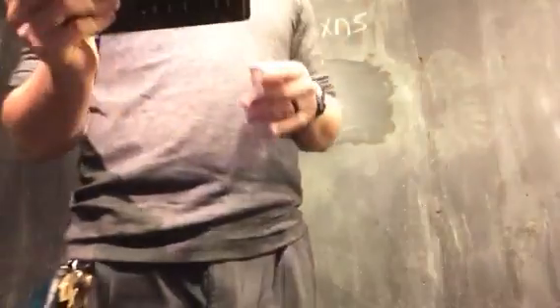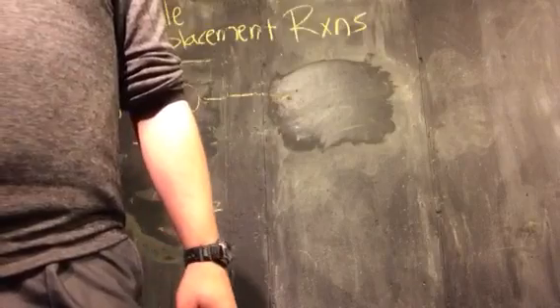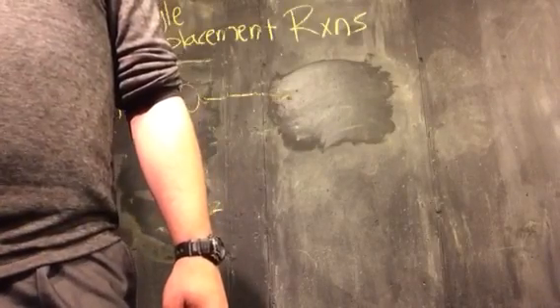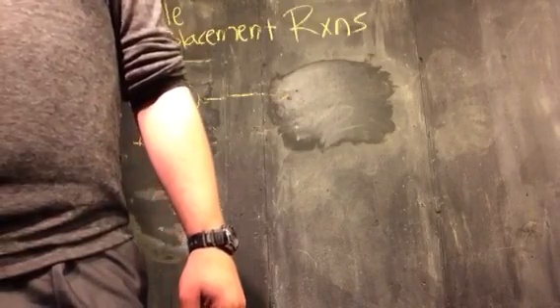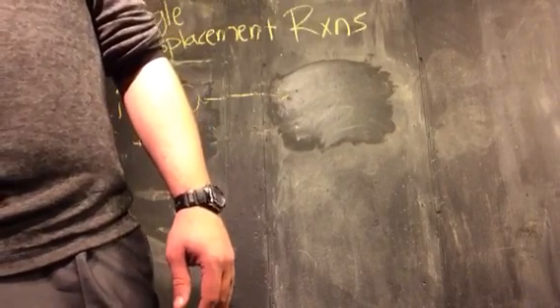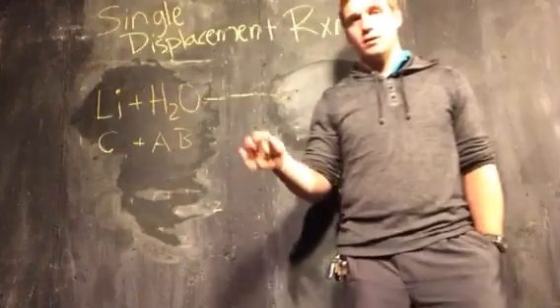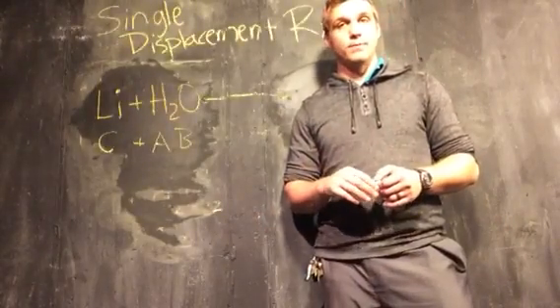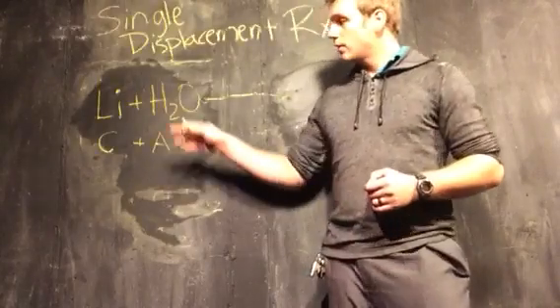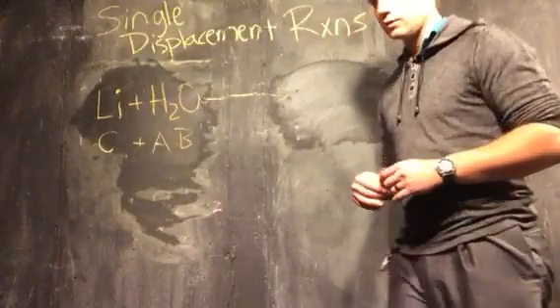So, it says that activity series will react with hydrogen in acids and in water. So that means that lithium is going to react with this water. So if I just put lithium in some water, it's going to react. Indeed, it's actually an explosion. And what you get, lithium is going to replace the hydrogen. Let's see what that looks like.